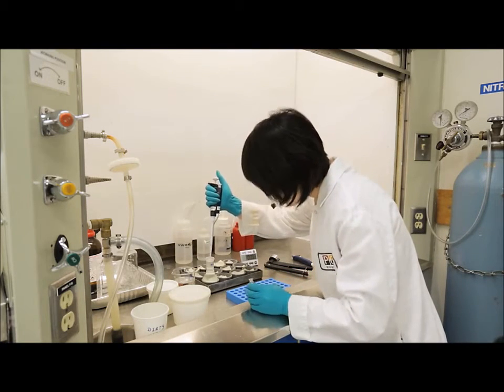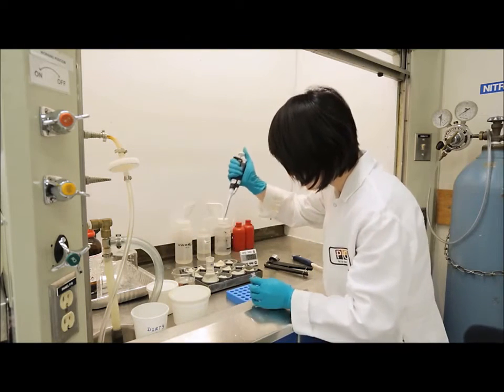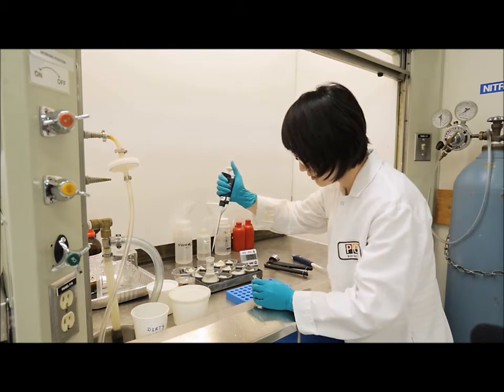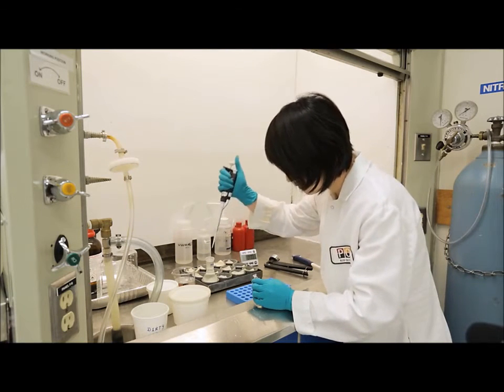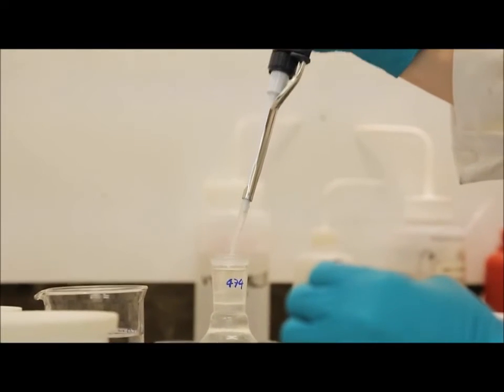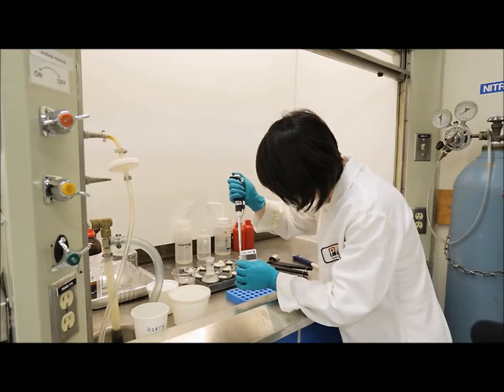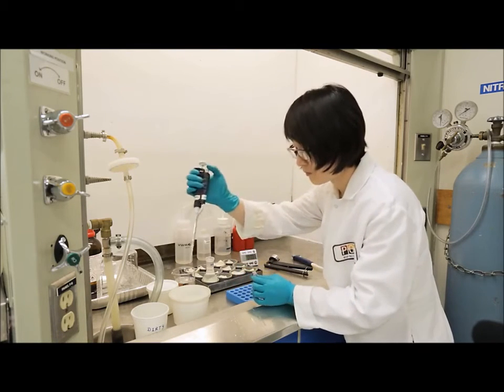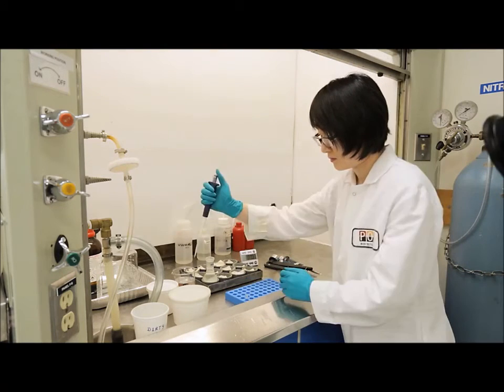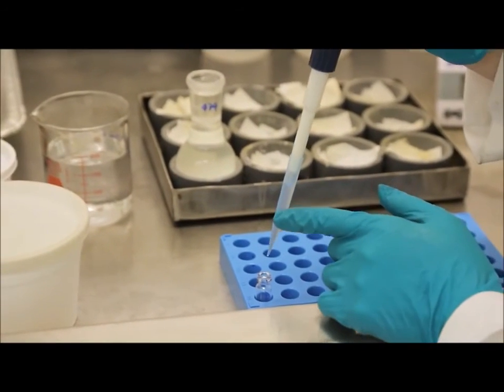When subsampling from the heptane layer, we typically rinse with the heptane layer a couple of times to ensure that we're not putting any sort of contamination into the GC vial. The amount of microliters that you add of the heptane layer to the vial will depend on the type of sample. Once you've added the heptane layer, the next step is to add 1 milliliter of heptane to the vial.